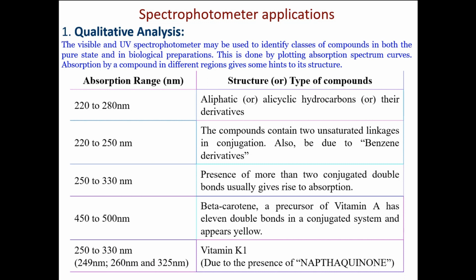Okay, very good. The aliphatic compounds are the compounds which show general normal linkage of the carbon atoms, like alkenes, alkynes, or even cyclic alkenes, and so on.